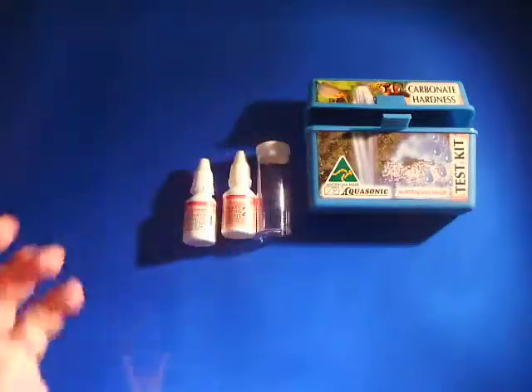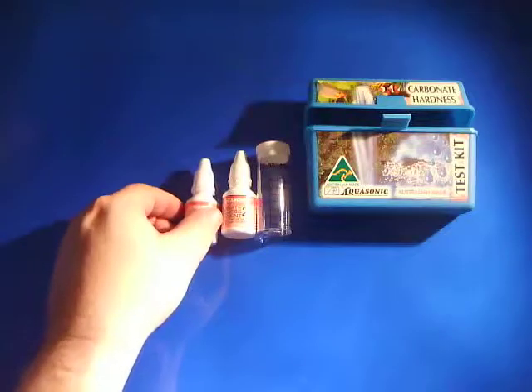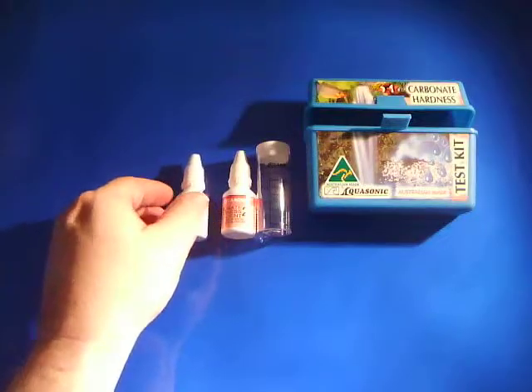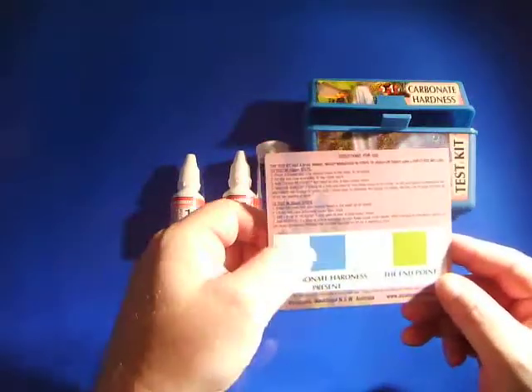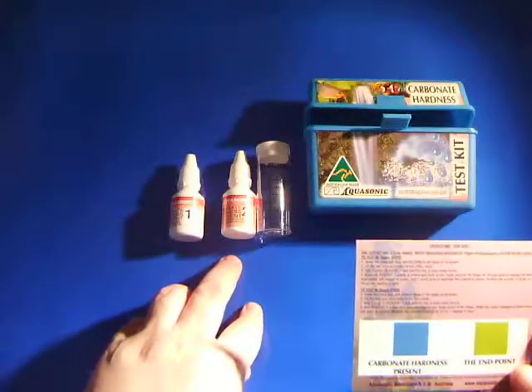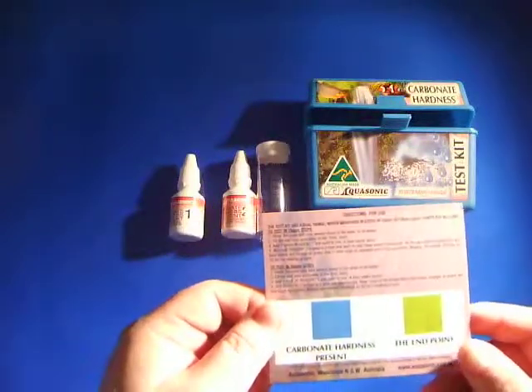It is pretty easy to start with — it is just a matter of getting the Reagent 1 and adding 2 drops. When you do that you should find that you will get a point of blue, and then what you are going to do is add drops from the second reagent until you come to the end point.